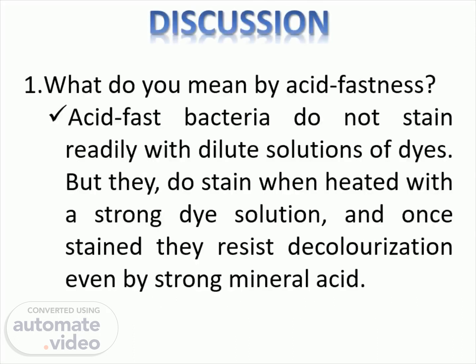Let's start the discussion. What do you mean by acid fastness? Acid-fast bacteria do not stain readily with dilute solutions of dyes. But they do stain when heated with a strong dye solution, and once stained they resist decolorization even by strong mineral acid.